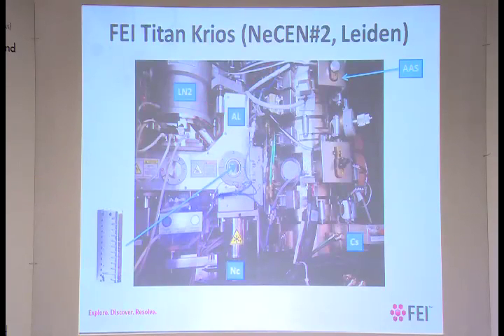Right. So this is the heart of a Titan Krios. So we have our cassette, which initially gets put in here, this cab, and this system is the autoloader. So it's both on the Titan Krios and the Talos Arctica. The cassette then gets picked up by the autoloader, so it gets positioned in this portion of the contraption.